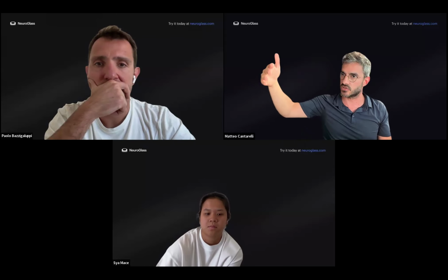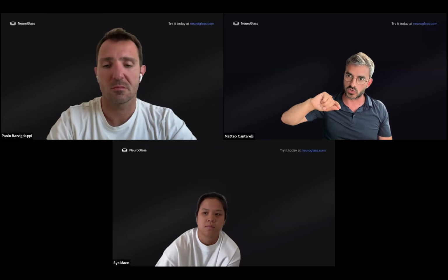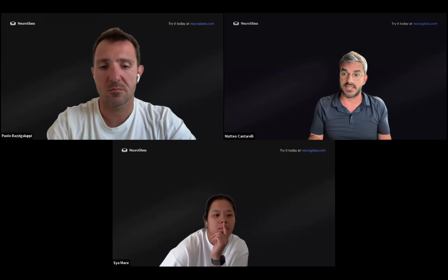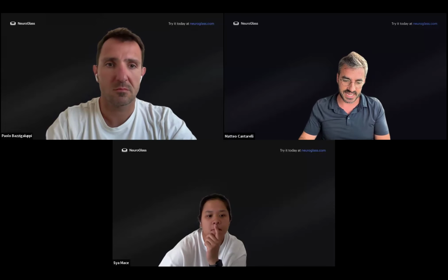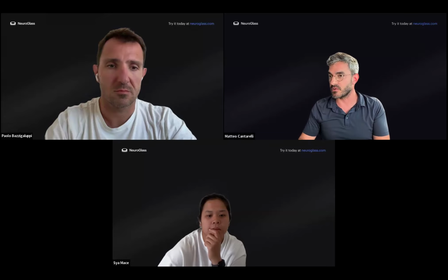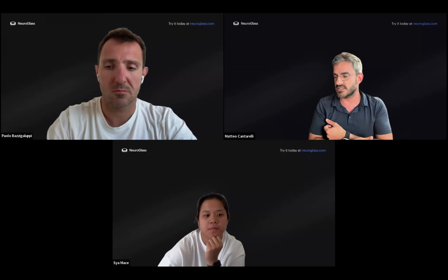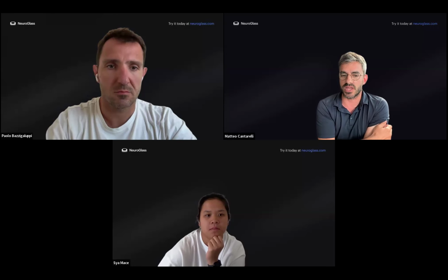Do you want to create a task to review each one of the skeletons? Yes. Boom, all the tasks for you. Okay. Do you want to assign them to these tracers? And then you have that happening automatically. And by the way, these are things that I'm saying as a result of having talked to many people who have these needs, but we're very happy to talk to more and more people saying, hey, what would really do it for me is if it was possible to do A, B, and C. This is how we've been building NeuroGlass, really. We listen to problems and we address them.